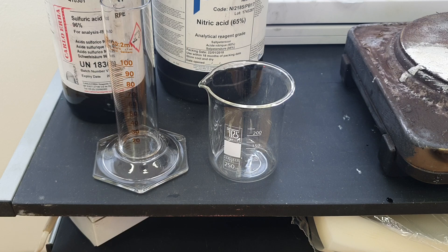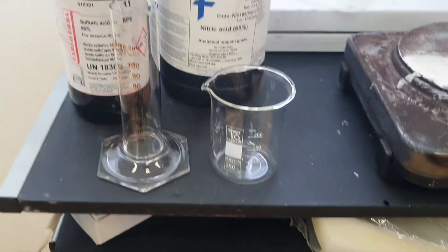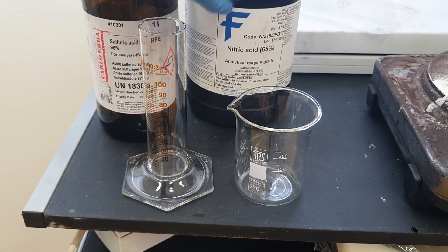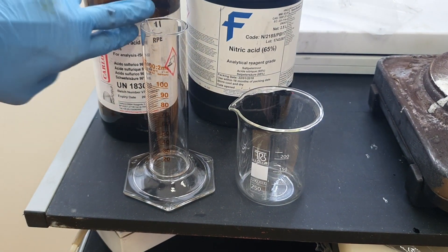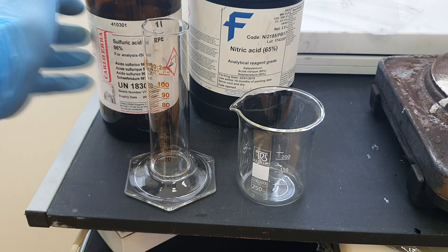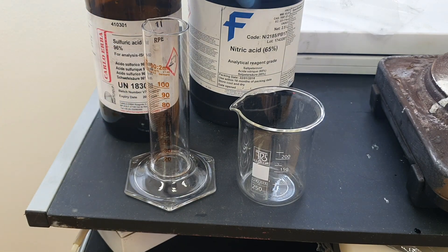Hello everybody. In this video I will try to make some chemical functionalizing of carbon fiber. To make this you need some sulfuric acid and some nitric acid in a ratio of 3 to 1. So you add 30 ml of sulfuric acid and 10 ml of nitric acid.